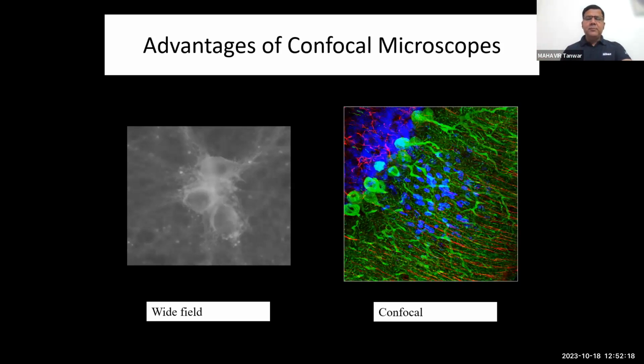But in confocal, you can perform multicolor imaging. As I said, confocal has photomultiplier tubes, so the number of detectors will decide how many colors you can capture. Let's say if it is a filter-based system with 4 PMTs, you can capture 4 colors simultaneously. In case of wide field, the number of cameras will decide, but normally users are doing this simultaneously with a maximum of 2 cameras attached.